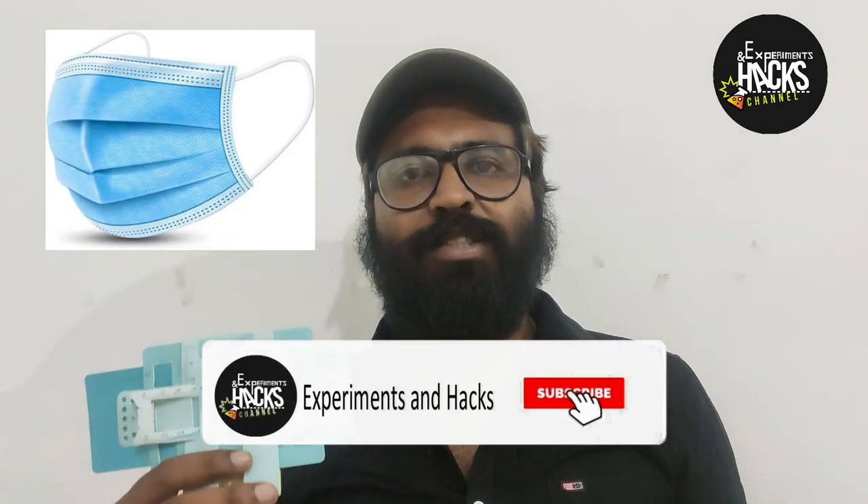This was invented by Manu Prakash, Indian-originated and an American invention from Stanford University labs. I am going to run you through a few interesting samples like blue color surgical mask and snake skin. This microscope is capable of zooming up to 140 times. It is called a foldscope and is made by folding paper. It has a ball lens, and the folding technique used to make this microscope is called origami technique.